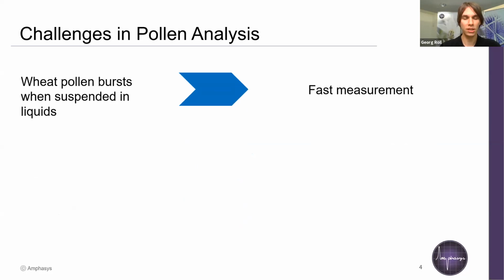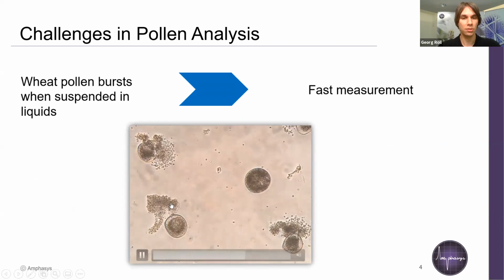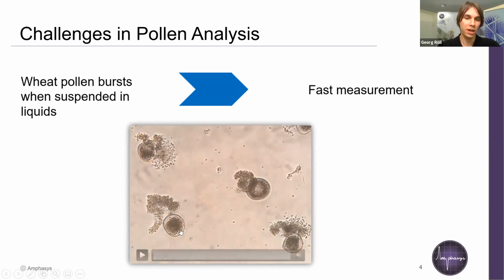And I have a really nice video for you where you can see how the pollen is bursting in the buffer. And you can imagine if the pollen bursts in the buffer, you cannot measure it with other techniques. So basically, it's considered then as a dead cell.